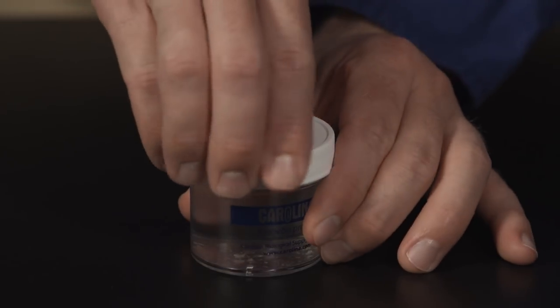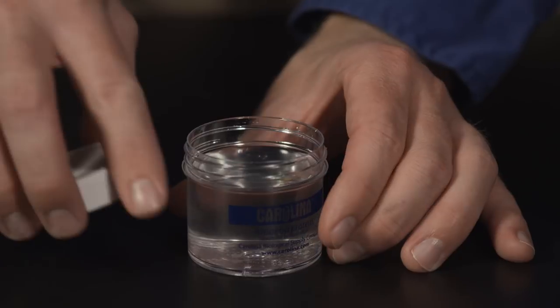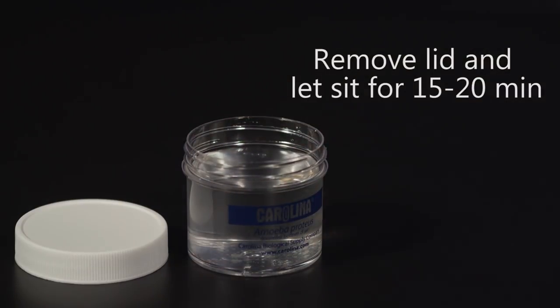To locate the amoebas in your delivered culture, first remove the lid from the culture jar and allow it to sit undisturbed for 15 to 20 minutes. This will allow the amoeba to settle to the bottom of the culture jar.